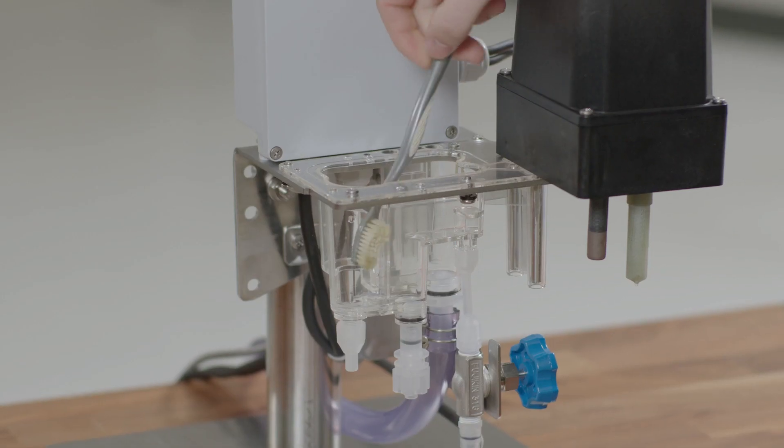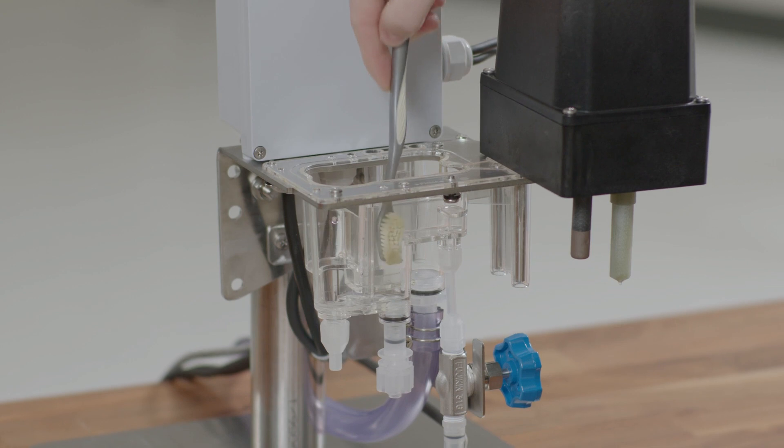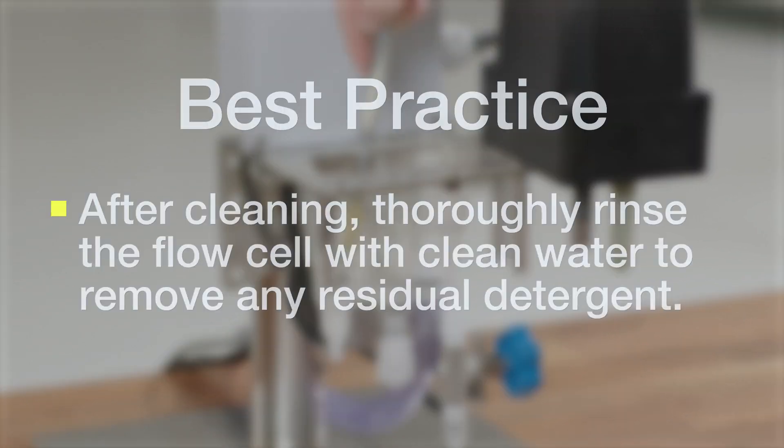Especially make sure that the inlet as well as the measurement and the reference areas are clean. Once the flow cell is clean to your standards, you want to make sure that you rinse it with clean water to get rid of any extra detergent, and then we can install the new beads.